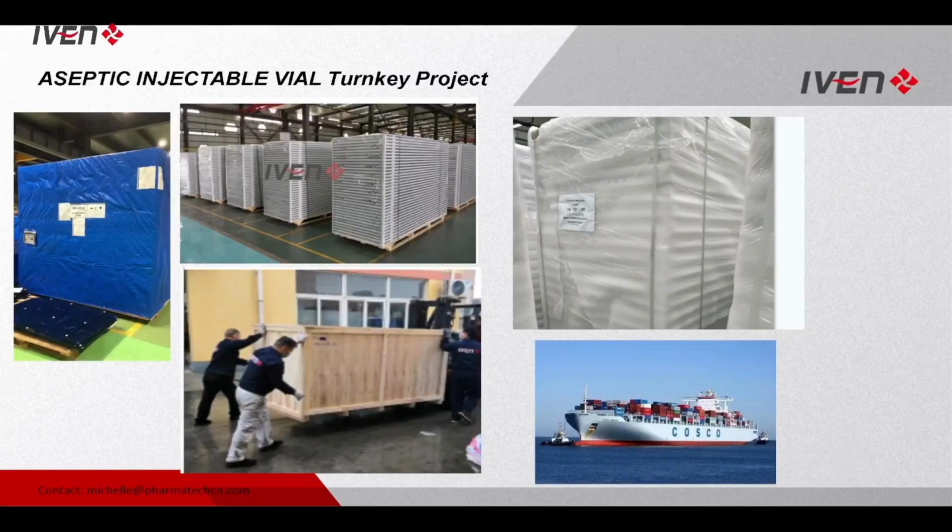After our machine finishes production and we finish the FAT, we go for the machine shipment and also prepare our workers' visas at the same time. You can see the machine before the shipment; we pack it very well to ensure the machine's safety during the shipment.